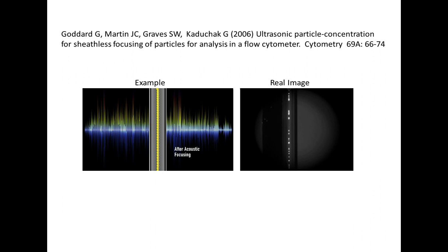Thermo Fisher has commercialized this technology in the Attune Next flow cytometer. What this meant to us is that we could try to develop a semi-washless protocol and reduce the time that we use to stain cells. The idea is to wash away the fixative normally and then incubate in antibodies in a small volume, then add one large dilution. The Attune instrument can run a large volume through rapidly, up to 1 ml per minute. The instrument can do this because the cells will all move to the center and remain in focus. Thus, the unwashed large volume sample might be able to go directly on the instrument after an incubation period and a dilution.